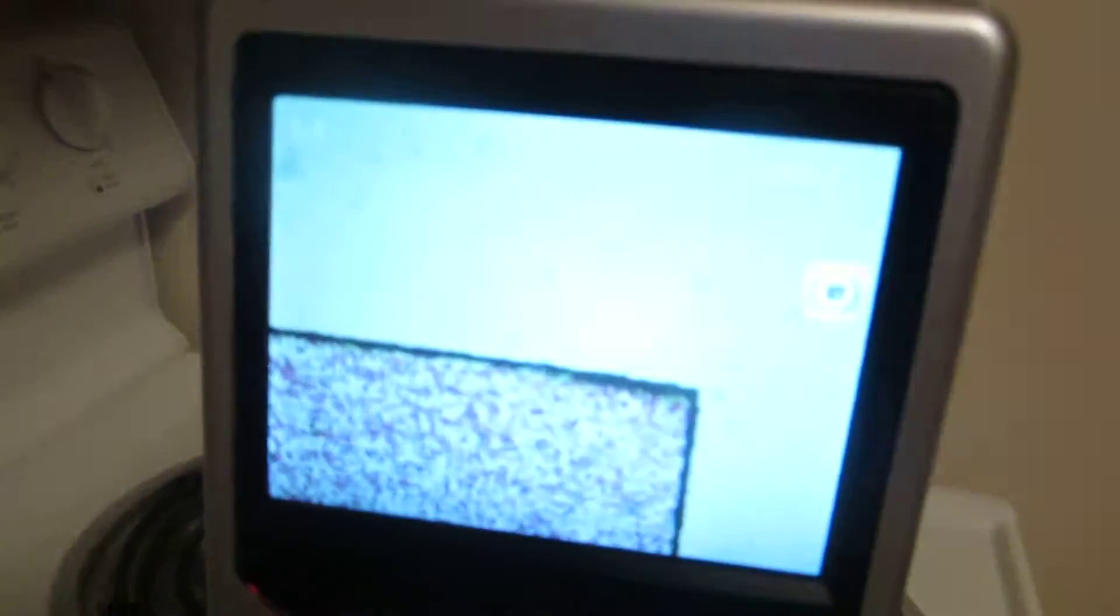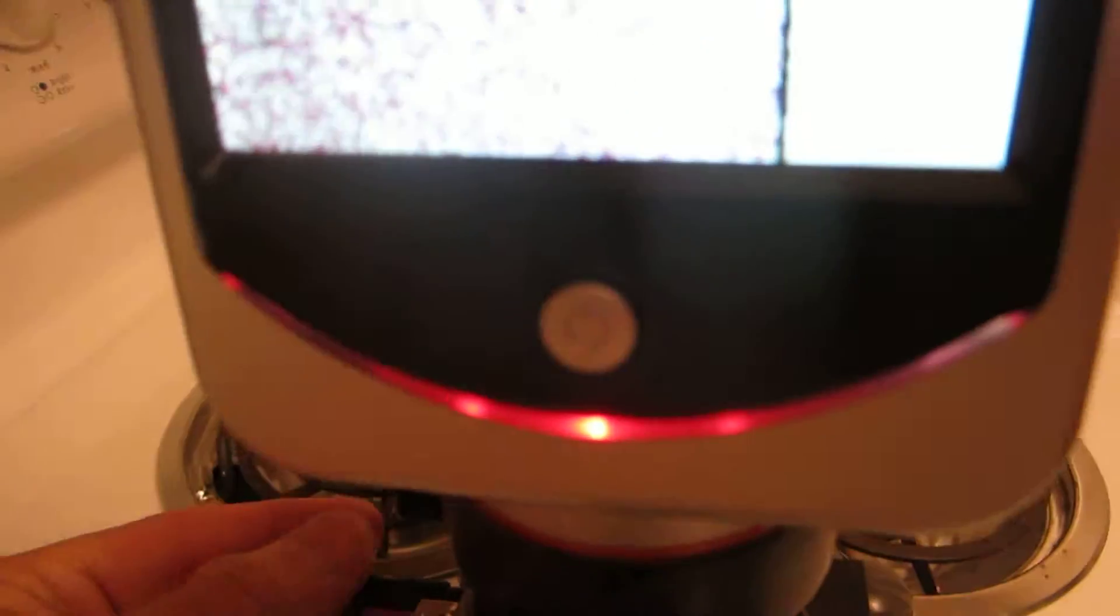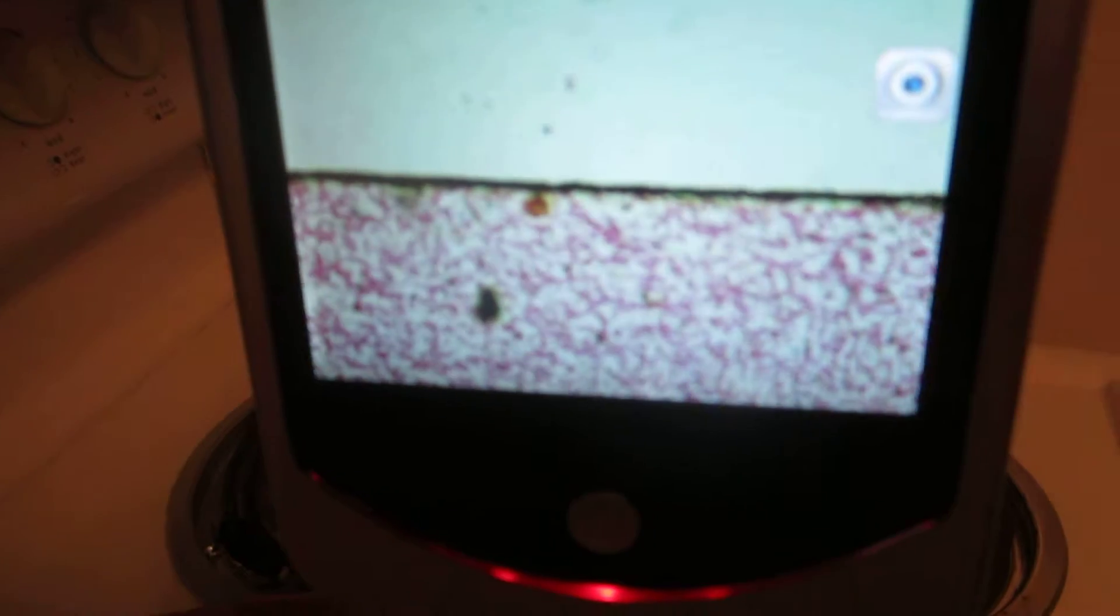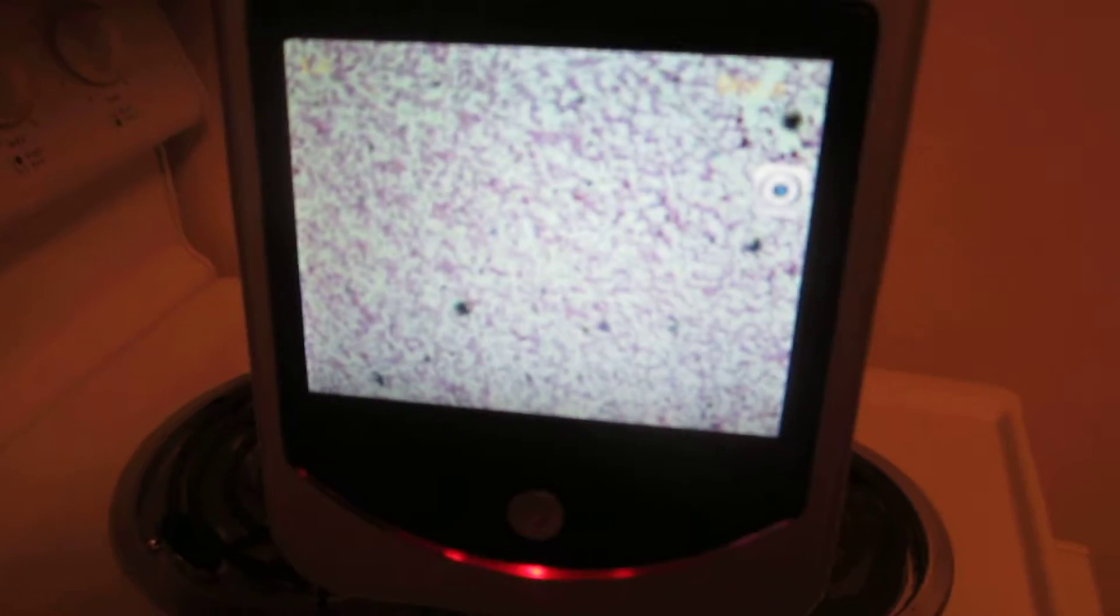Now we already have the slide in there. I like the human blood slide. You see we got the edge of the cover slip, so we'll center it here so we're in the specimen. That looks halfway decent.